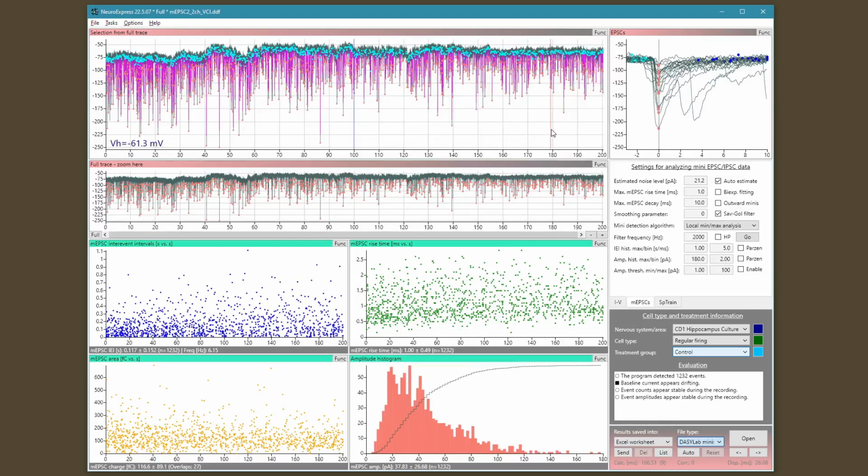When this happens, you can define a range of interest. For example, you decided to perfuse your preparation with a neuromodulator that can change how these synaptic transients are generated, and how many minis are basically produced during the drug application.